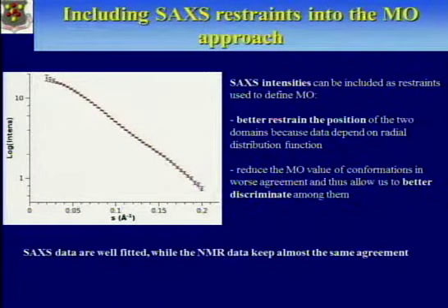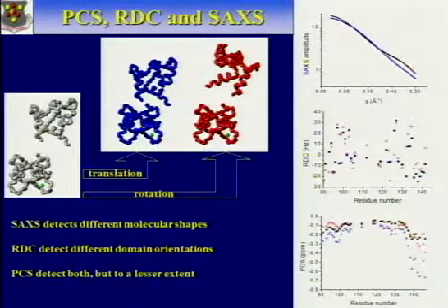So the real usefulness is probably to distinguish between, let's say, elongated configurations with respect to compressed ones. But whether it's closed like this or like that, as Al pointed out yesterday, probably it's not really in the SAXS data. But you can see that better from the pseudocontact shifts, for example. So basically, we can put everything together, and that's in the portal. This is telling you why combining the different data is useful. But I guess now it's really too late to go into that detail.